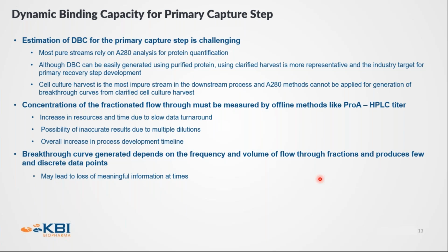What happens here is that there are a lot of resources involved in just analyzing that many fractions. Also, it takes quite a lot of time. Plus, it is very operator intensive. There are a series of dilutions to be made, and all these things can introduce error into your calculations. And the thing which we are most concerned about is that it increases the overall process development timeline.